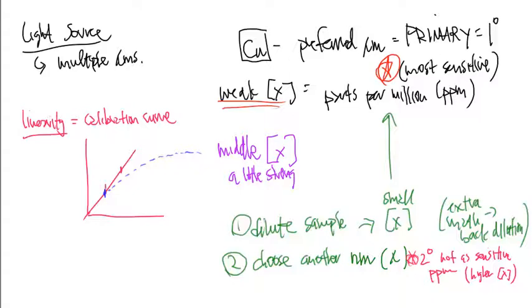So I'm going to draw two pink lines here and here. And this represents the area of the secondary wavelength. Linearity is evident, but linearity is only typically in mid-range. That means too high, it won't work. And then too low, it won't work. But it does a very good job in the middle.